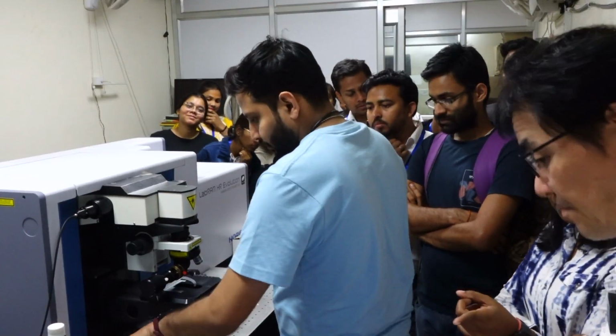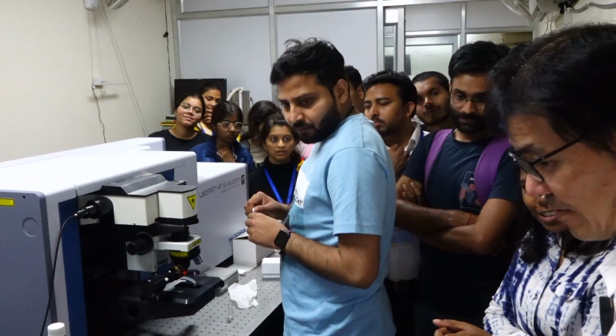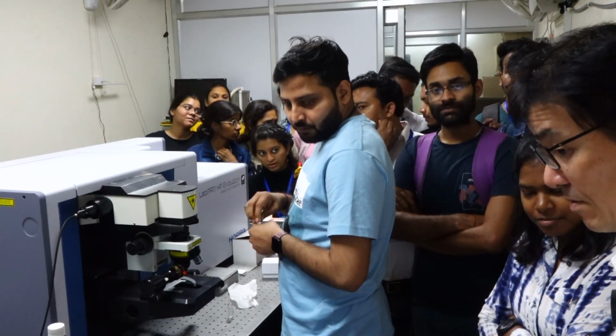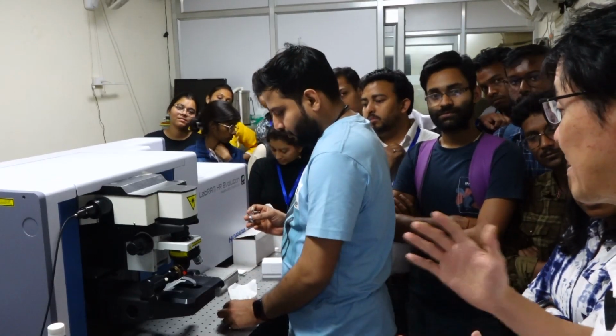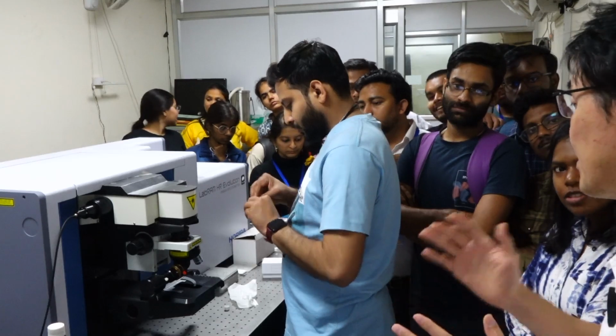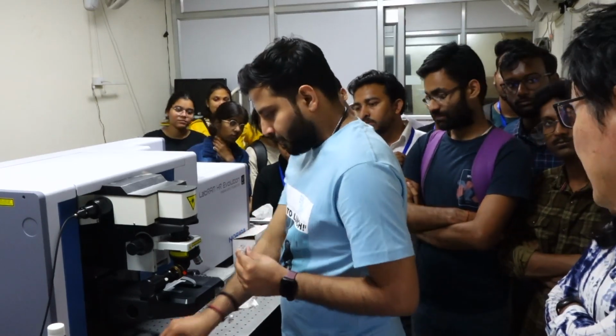Sir, is it okay if such a peak exists in the final data when sending for publication? No. During data analysis, we have to repeat the experiment, by increasing the accumulation number, and make it very steep.